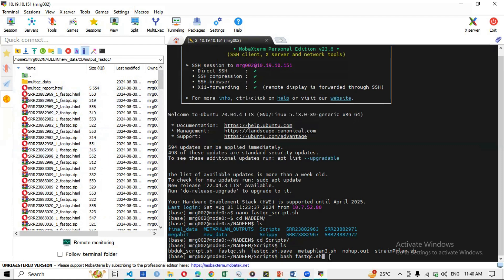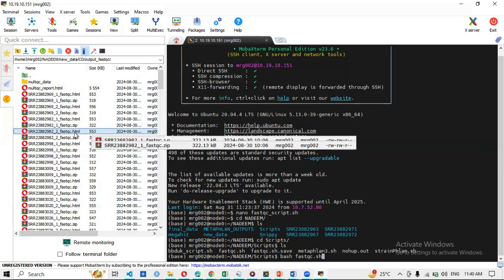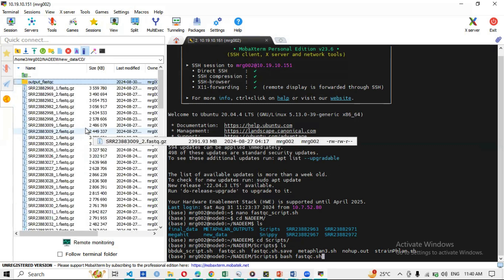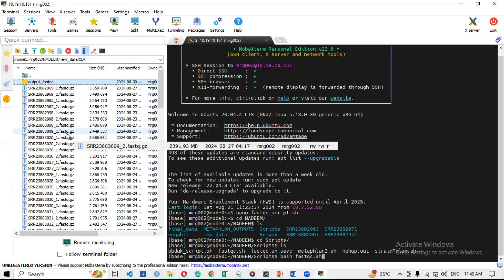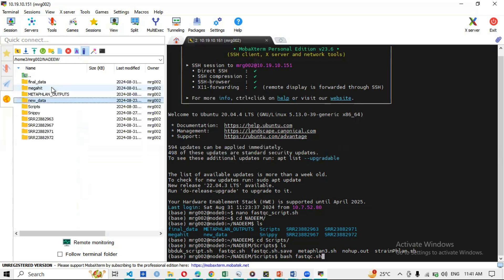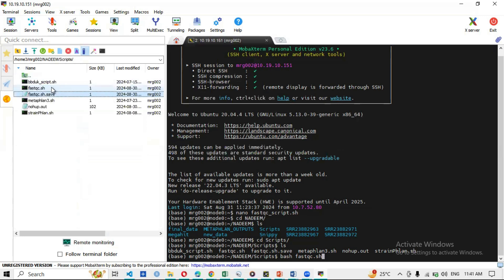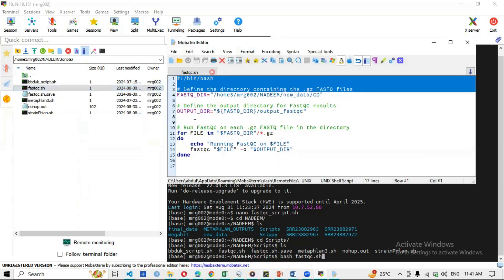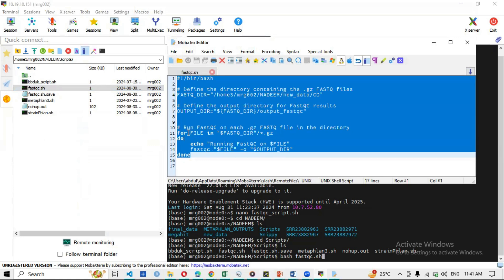An important tip: when you write a script, copy it and paste it into ChatGPT and ask it to check for syntax errors. Linux is very strict — even a single extra space can cause an error. ChatGPT can identify and fix syntax errors quickly, so you can then copy the corrected script back, paste it into your terminal, and execute it. This approach works very well.